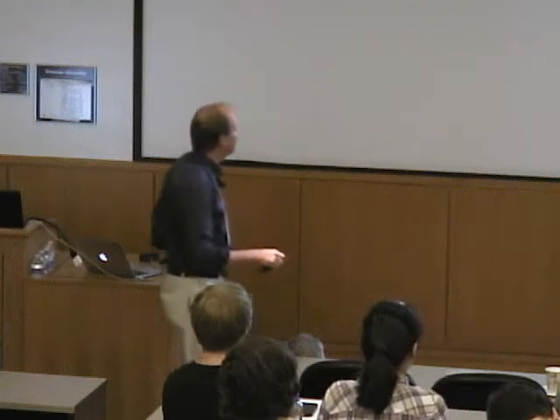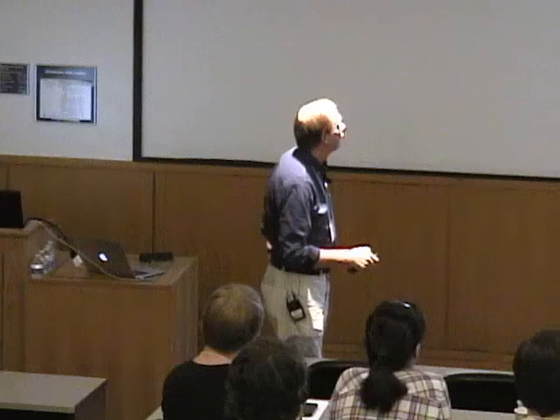So here I've got the signal intensity plotted as the inverse of temperature, right? And so going to the right on this plot is a decrease in temperature. So as I go down in temperature, the signal will increase, and increase linearly as 1 over T, and this is known as Curie's law, of course. But as we go to lower and lower temperature, what we observe usually is that because the relaxation then also starts to become slow, eventually we get to a point where the signal will saturate on us because the relaxation is too slow. And so that means that typically there's some kind of maximum in the temperature dependence. So there's a temperature at which we will get a maximum signal.